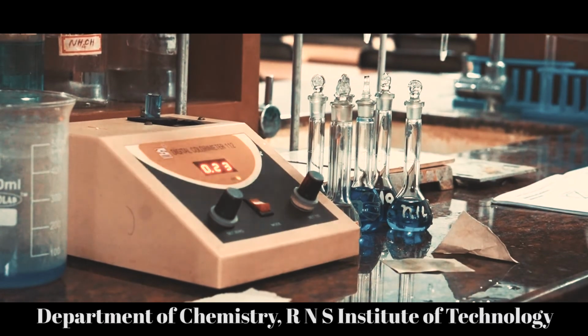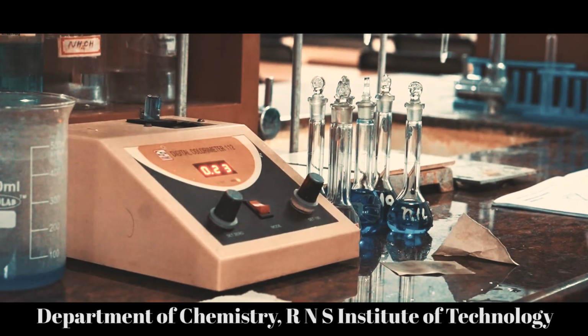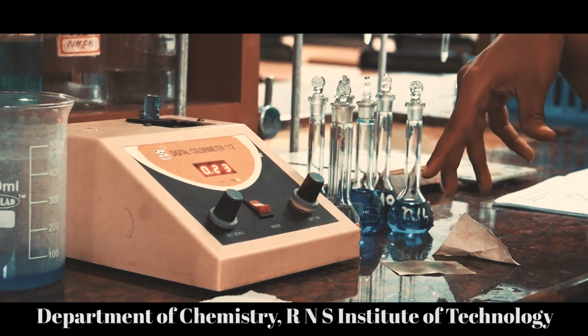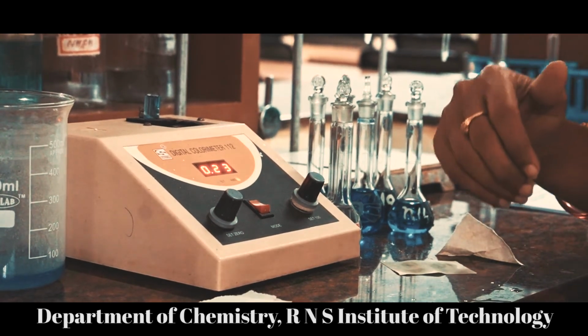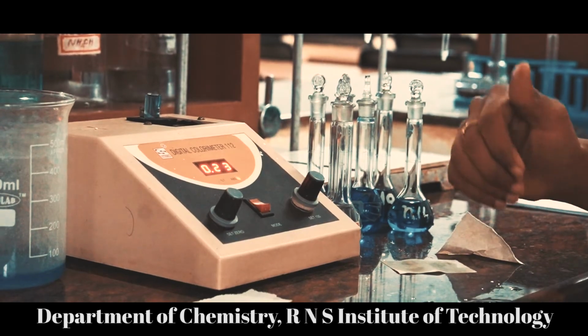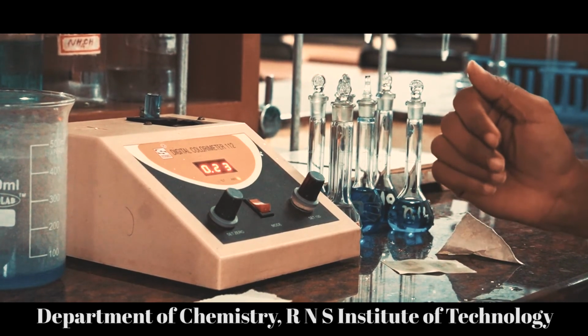As you can see, the absorbance of the unknown solution is 0.23, which is totally different from the absorbance of all the other solutions. And now we will plot a graph with all these values, absorbance versus volume of electroplating effluent.